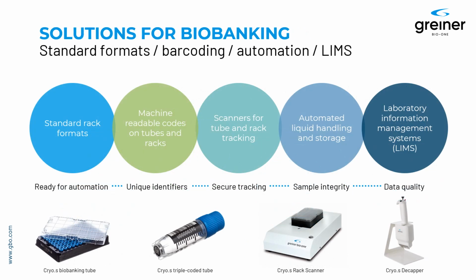There are several solutions available for biobanking and high-throughput cryopreservation tasks. They include labware, they include machines and devices, lab automation, and they include software. Let's start with the labware.